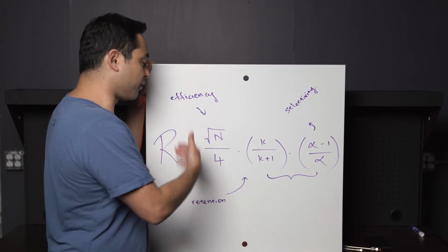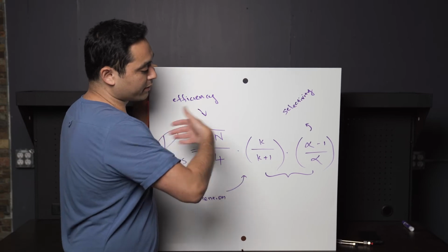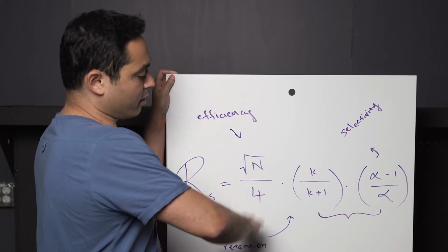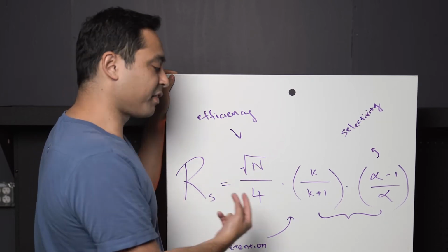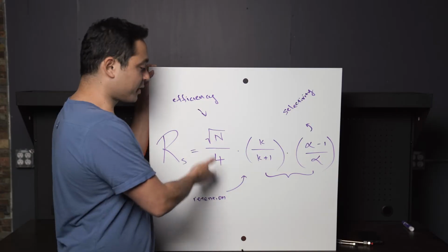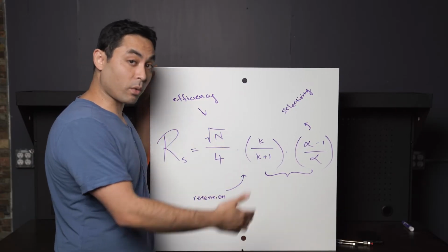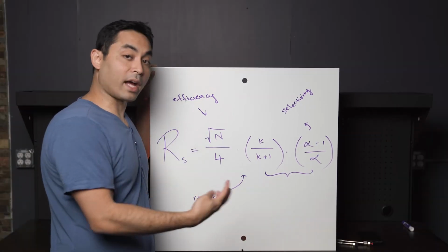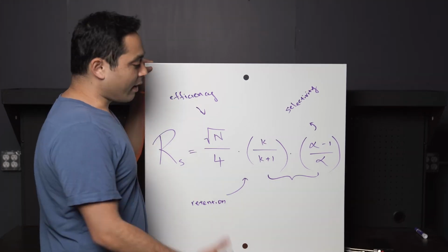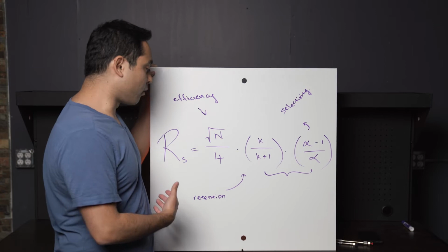So a doubling of efficiency leads to a 1.4 times increase, but a doubling of selectivity can often lead to much more than that. What a lot of people are focused on is efficiency. But if you have peaks that are very co-eluting, what we call a critical pair, this won't do as much. And the pressure increases by a square. If you halve the particle size, you increase the pressure by a factor of 4, which is why you need a UHPLC.